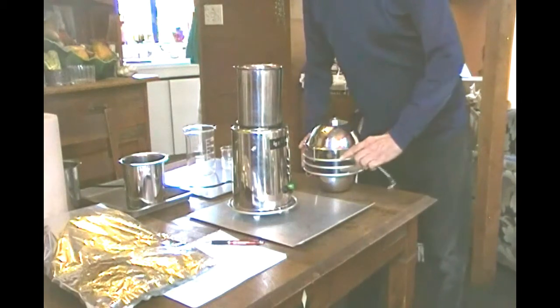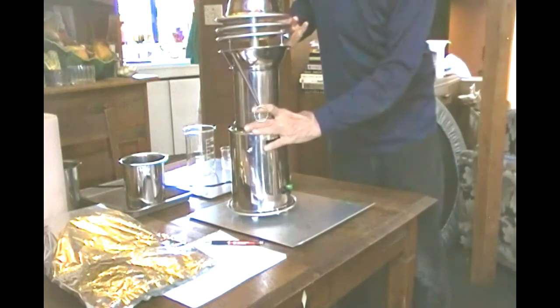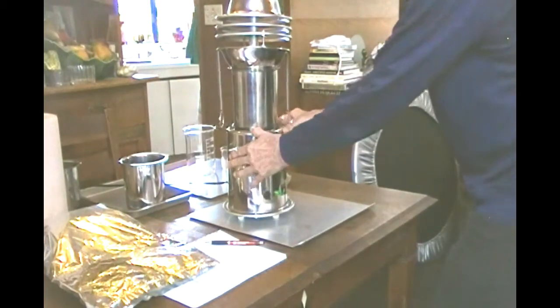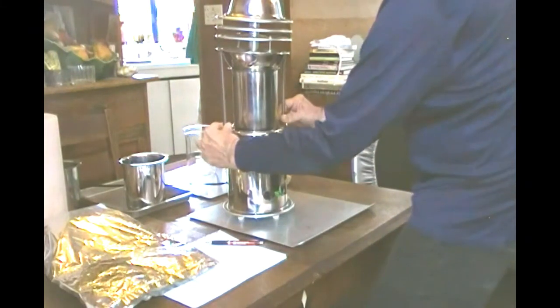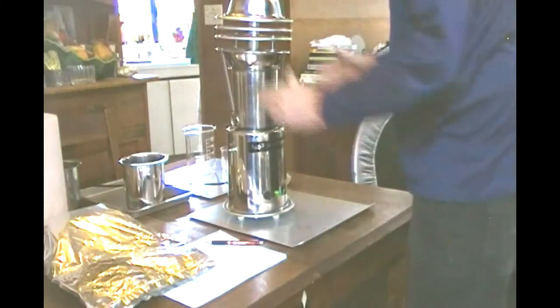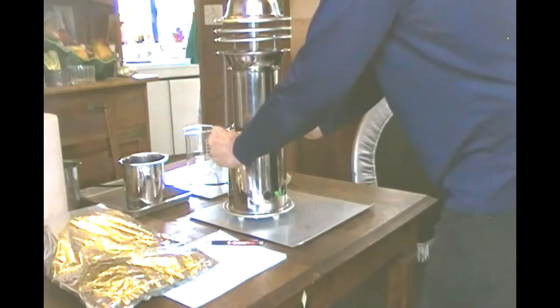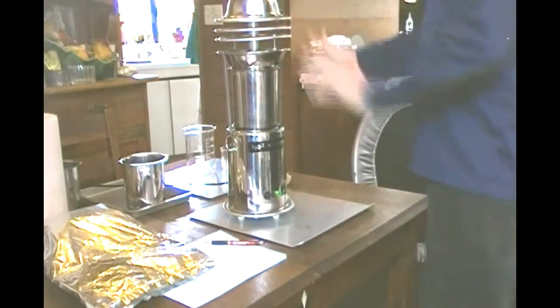Now I'm going to attach the condensing unit. This is something that you want to practice a few times before you actually do it. What you practice is grabbing the 2 rings, pulling them down with equal pressure, and hooking each ring to the post. By practicing it, put them on, take it off, put it on a few times, get a good feel. Because if you don't have a little bit of practice doing it, you might tend to pull one down harder than the other, which would cause this to tip.